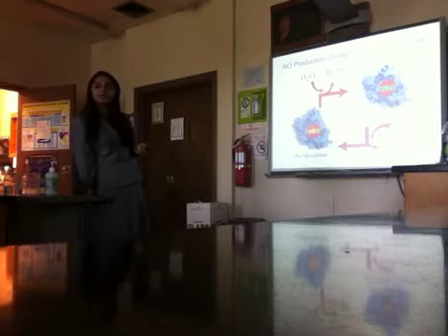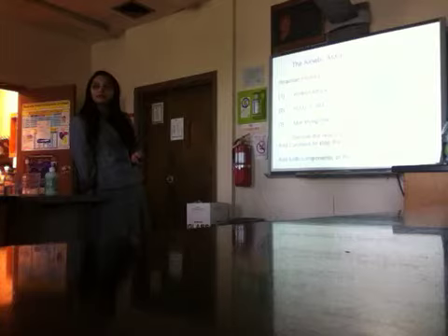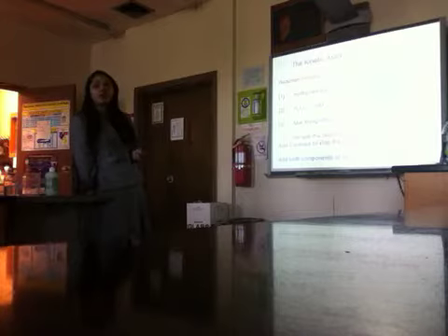So now let's look at the concentrations. That's why the concentration of the myoglobin is very low. You don't need a lot of it, whereas the H2O2 is in more amounts, so it has to be in excess.